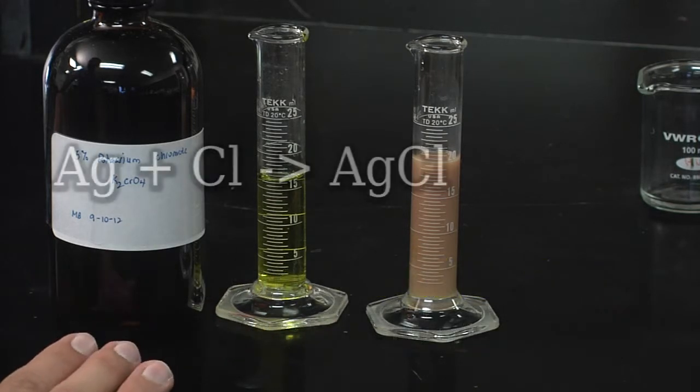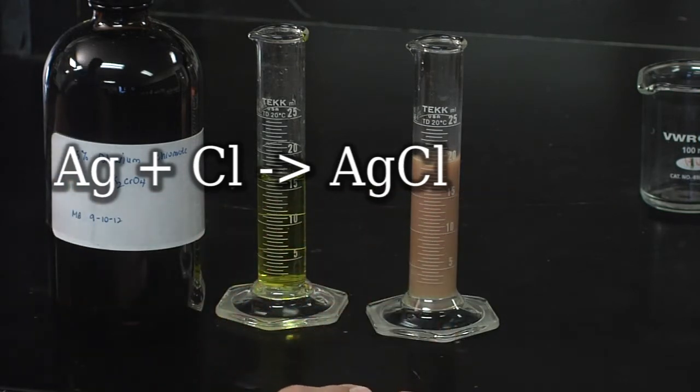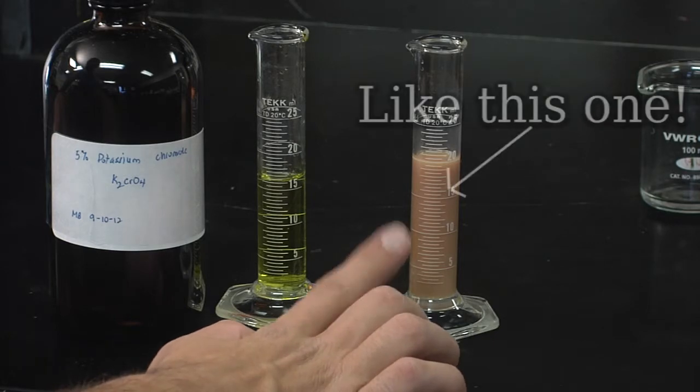So initially, the silver ion will react with the chloride to form precipitate silver chloride. Once all of the chloride is removed, the silver will react with our indicator to form a red-brown precipitate.